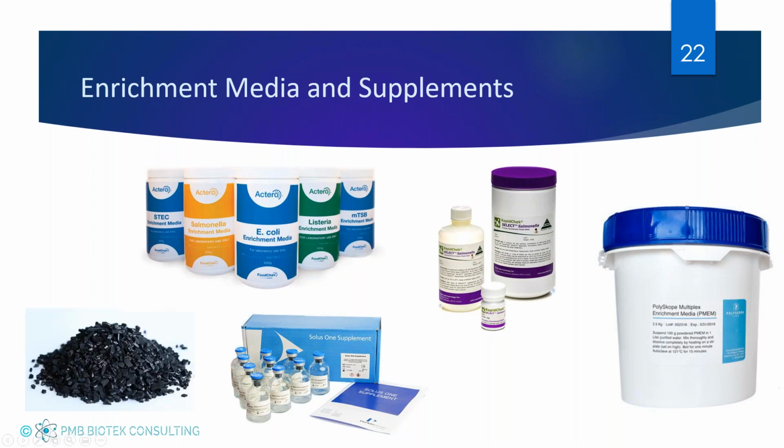You'll also see certain supplements such as charcoal that can be added to products, and charcoal is a natural absorbent, and it pulls out PCR inhibitors from supplements. So if you're looking for a way to validate an in-house method, I always suggest looking at charcoal first. Adding some charcoal to your enrichment protocol can really help reduce some of that background interference you see. And it doesn't have to be at a high concentration, and charcoal is a relatively cheap product to use.